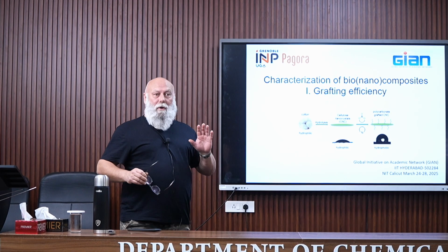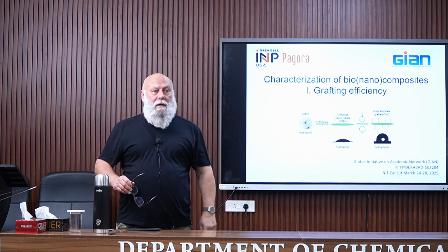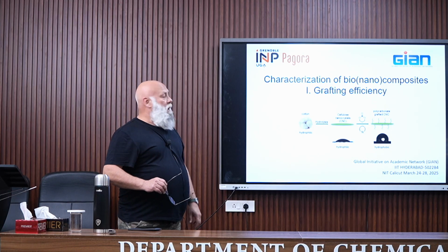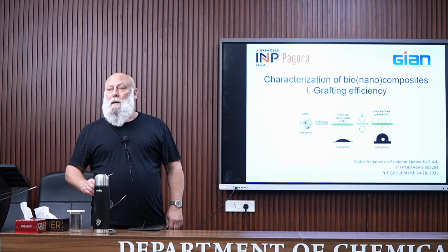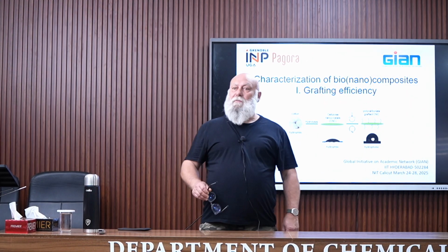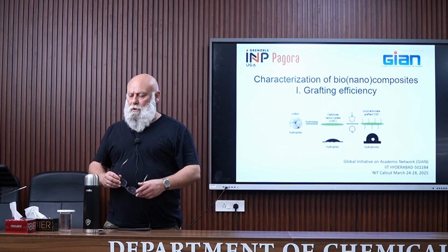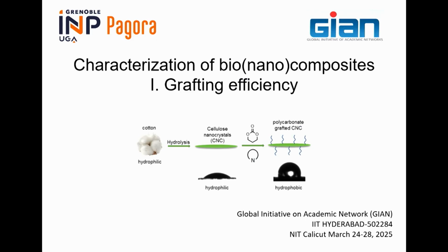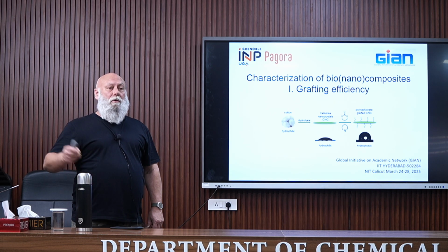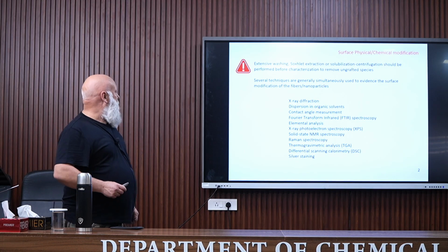Today we have two lectures on characterization of both biocomposites and bio-nanocomposites, and it is divided in two parts. The first one is the characterization of the grafting efficiency, because remember that many times it's necessary to modify the fibers or the nanoparticles to impart some hydrophobicity or other properties. And so, of course, it's important to know if the grafting was effective or not. And the second part would be on the characterization of biocomposites and bio-nanocomposites.